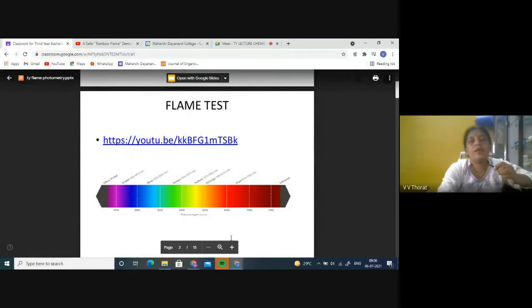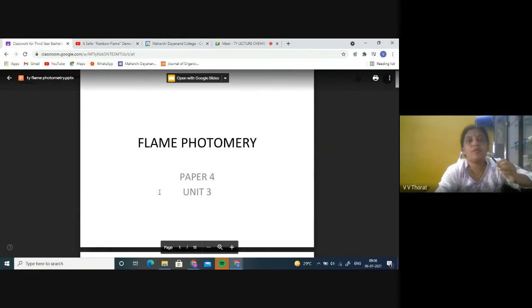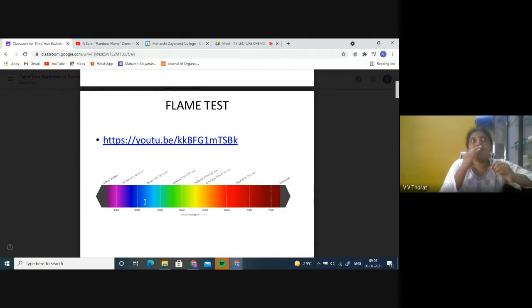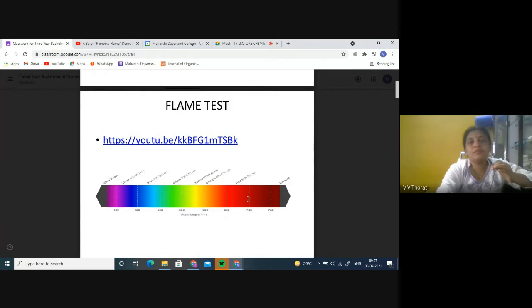Yes. So what happens is, depending upon the color of the flame, you will come to know whether calcium, copper, or potassium is present. And this technique was further developed into an instrumental technique called flame photometry. In the flame test, you used to find the color, and then you were always confused. Madam, it is orange red. Sometimes you would say, Madam, it is reddish crimson red.